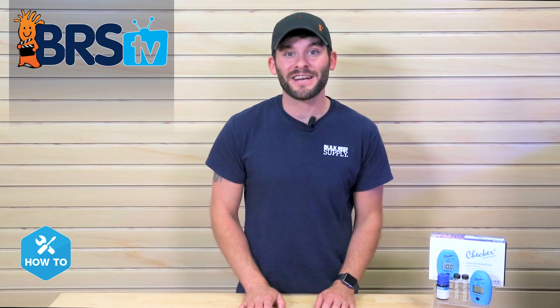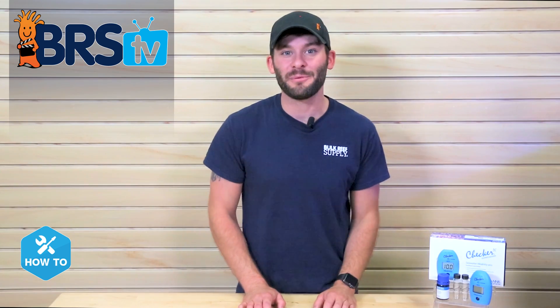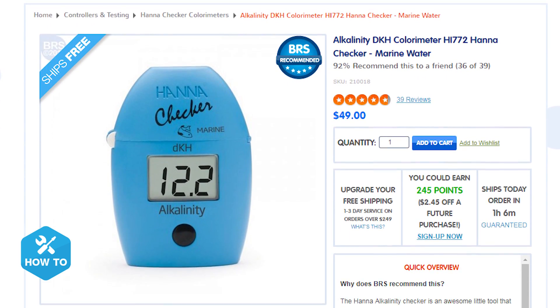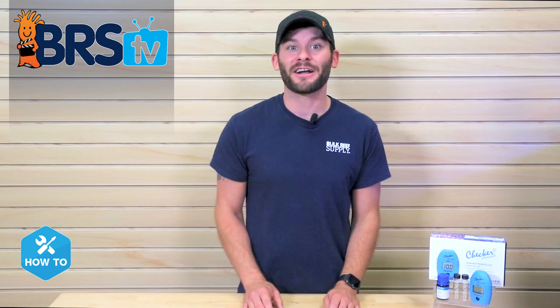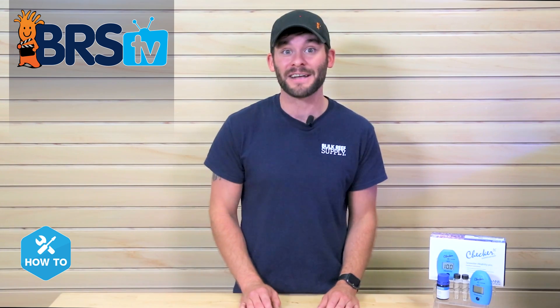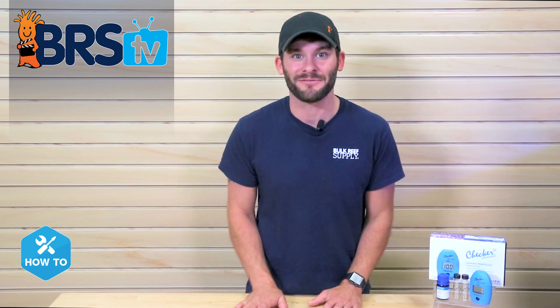There are quite a few types of Hanna checkers available, but if one gets the BRS Staff Favorite Award, it would have to be the Hanna Alkalinity DKH Checker. Many of us check our water parameters daily or every other day, and using this checker can really save you time and hassle when checking your alkalinity levels.